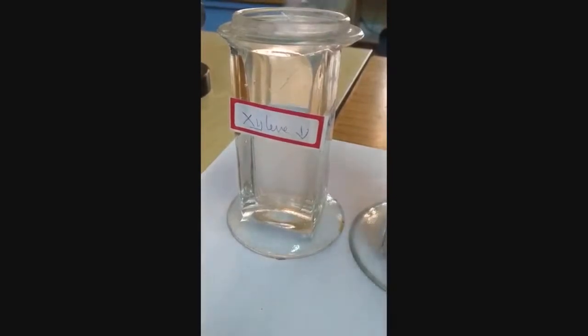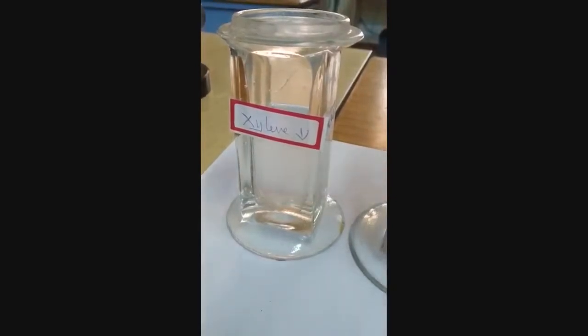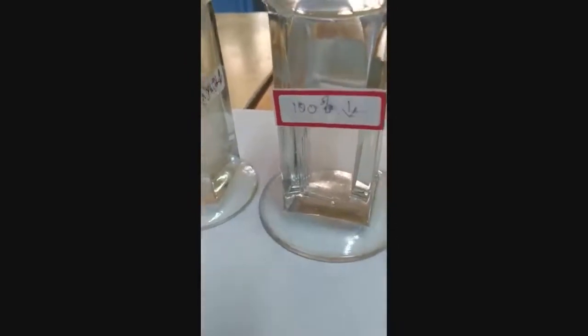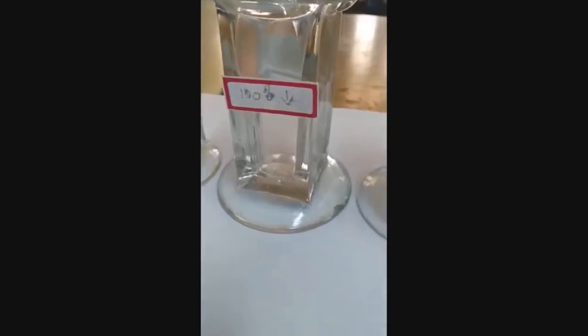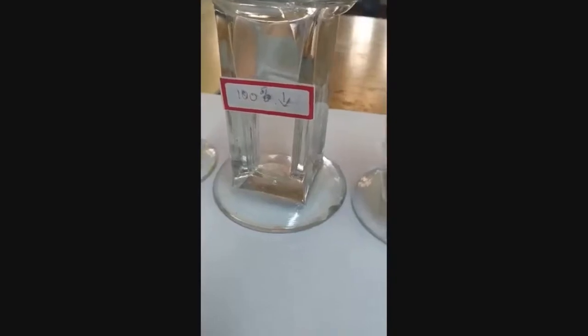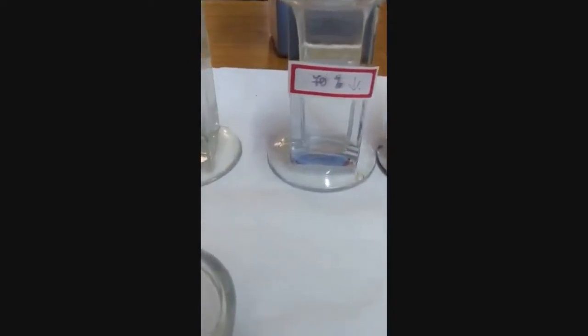After about 10 minutes, remove the slide and immerse it in absolute alcohol. We are now downgrading the tissue. Downgrading is a process where we pass the tissue through 100%, 90%, 80% and 70% alcohol.